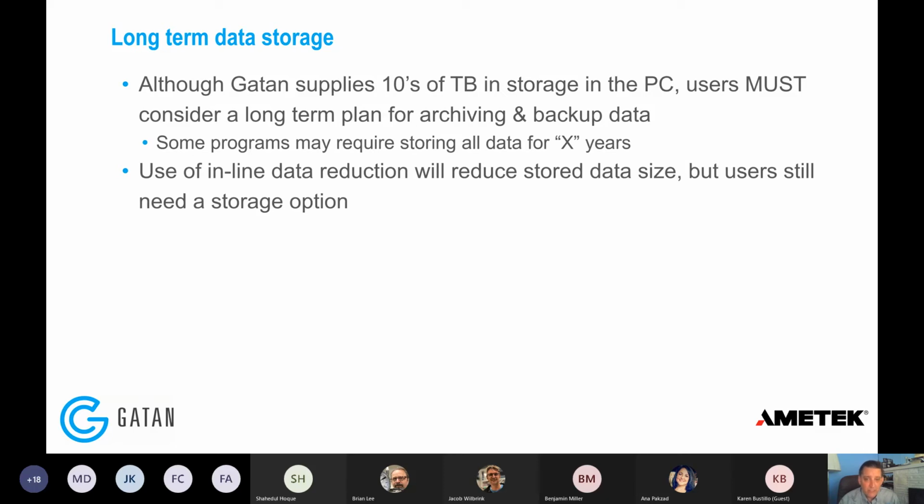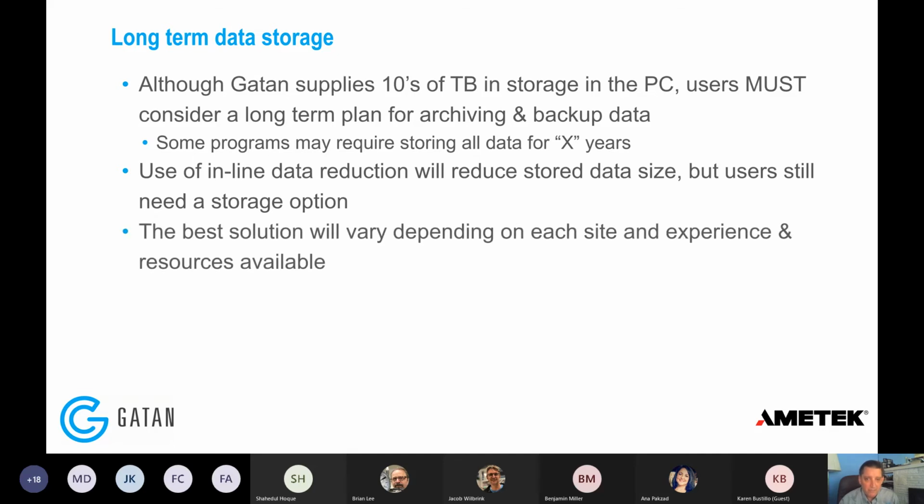The inline data reduction is probably your best friend in this case, because you can optimize your experiment and your data acquisition so that you collect the data that you are most interested in, and you don't need the rest of it. Things like look back are extremely helpful for this. But in spite of that, at some point, whether it's 6 months, a year, 2 years, you will need to expand the storage options.